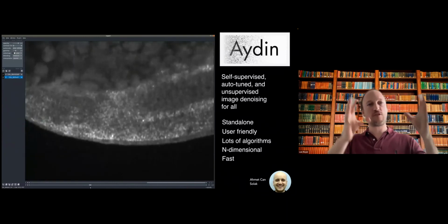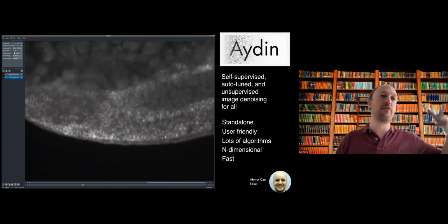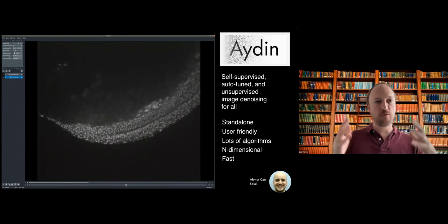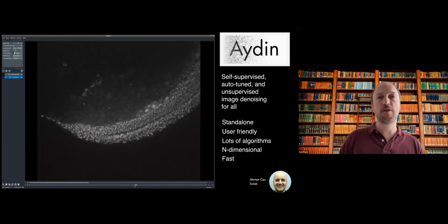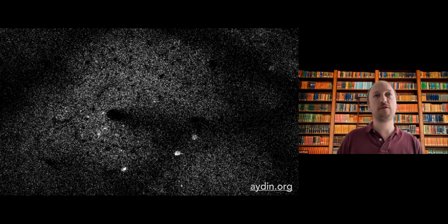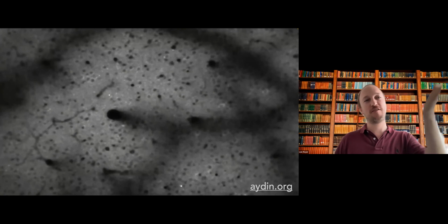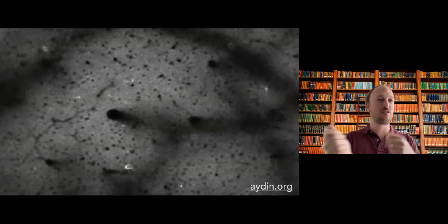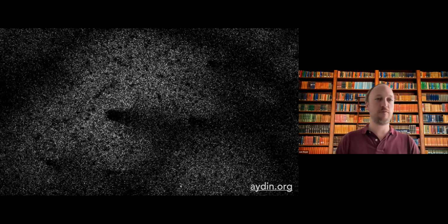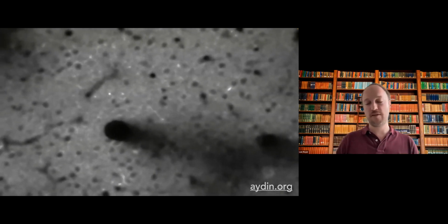But I just want to show that it's actually possible to use Napari as a library that will help build other things from it. And that's the power of open source and its modular design principles that are behind everything we do. So you can do things like, for example, animations where you have two layers. One layer is the noisy image, and another layer is the denoised image, and you can just generate these beautiful animations by changing the opacity. And so everything we do now in terms of visualization, in terms of showing the results of our work, everything we do is based on Napari now.